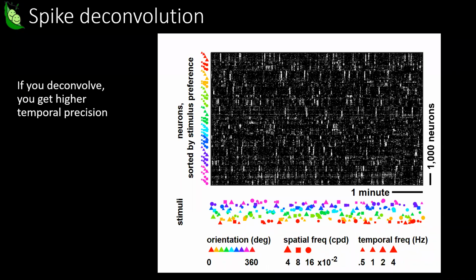So, I think there's another question there. Can you find a threshold that works for every cell as well? I think what we've seen and what other people have seen, in our review paper in Current Opinion in Neurobiology, we do an analysis on some ground truth spike data where they have cell-attached recordings and the calcium imaging. And what you see there is a pretty big variance in the amount of the GCaMP blip that occurs with a single spike. So it's hard to say how much GCaMP corresponds to a single spike, and it varies from cell to cell. So I would be very wary to set a threshold and say this is 1 spike, this is 2 spikes, this is 3 spikes.